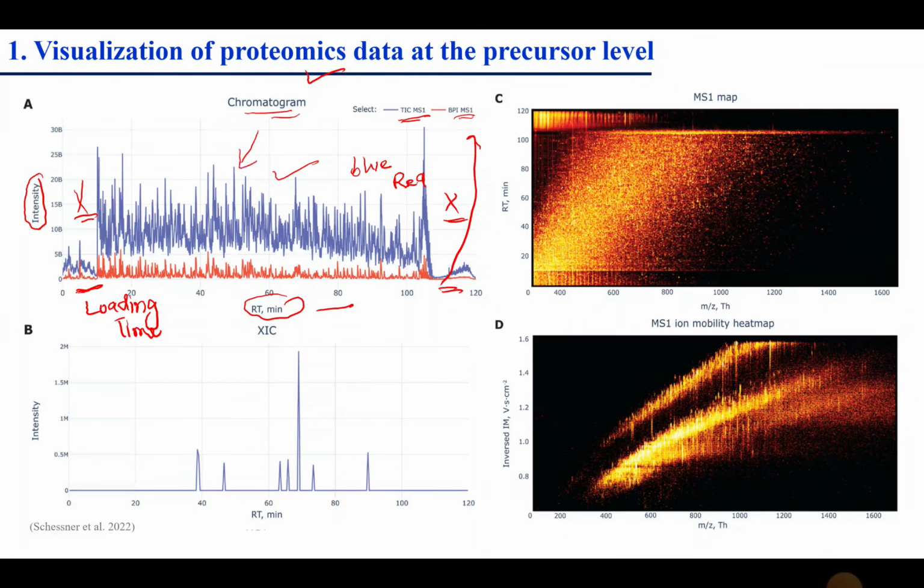As you can see, this chromatogram is so messy that it is almost difficult to extract the different proteomics or peptide based information. So it is important to extract only the relevant information and discard the remaining. So how do we do this? We achieve this through the extracted ion chromatograms. Now we have discarded some of the length and retained only the important length.